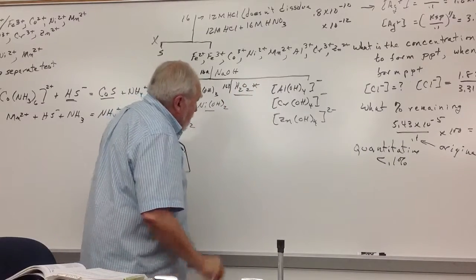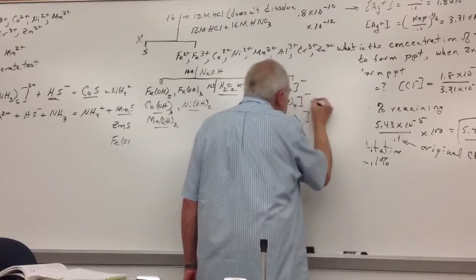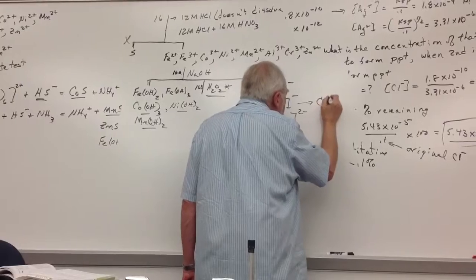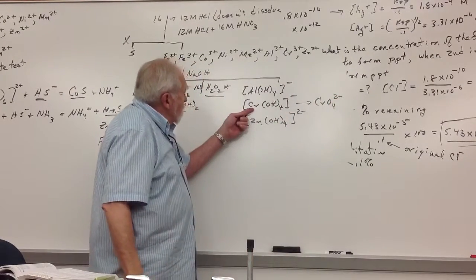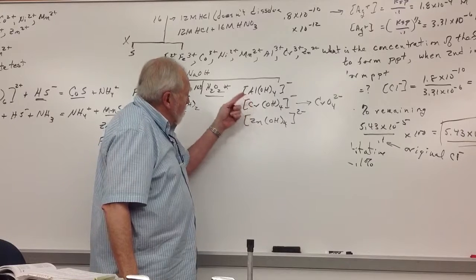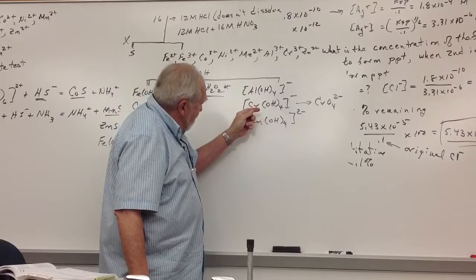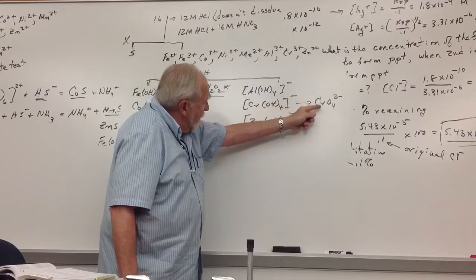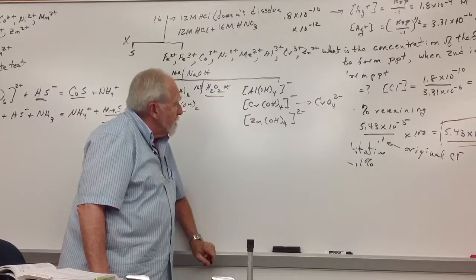The hydrogen peroxide is in there to convert the tetrahydroxochromate 6, I'm sorry, that's chromate 3, to chromate ion where you increase the oxidation state of chromium to +6.